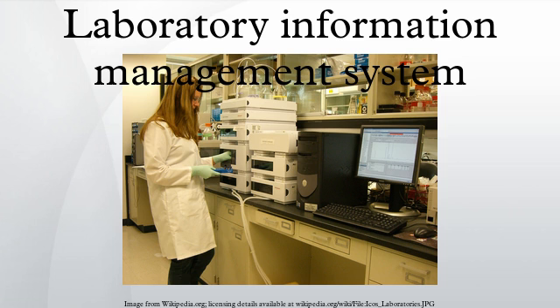Modern LIMS have implemented extensive configurability, as each laboratory's needs for tracking additional data points can vary widely. LIMS vendors cannot typically make assumptions about what these data tracking needs are, and therefore vendors must create LIMS that are adaptable to individual environments.